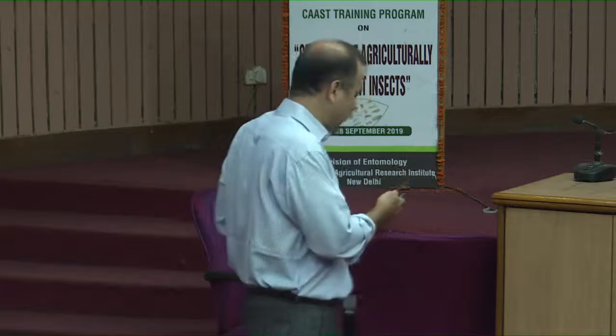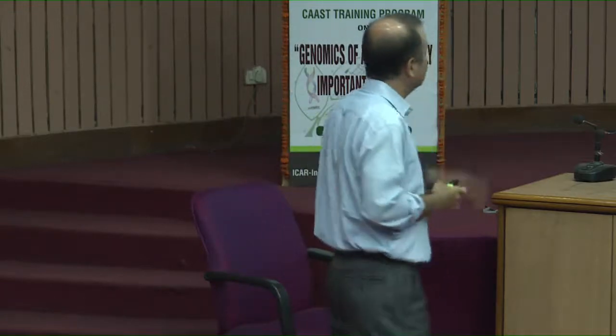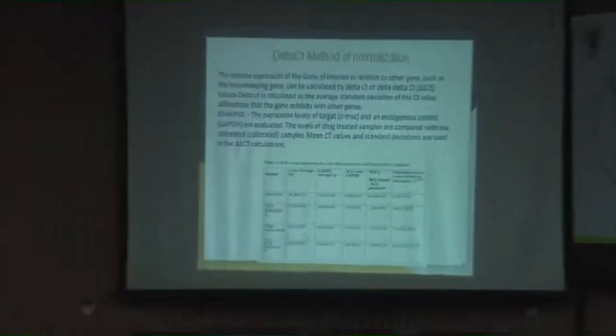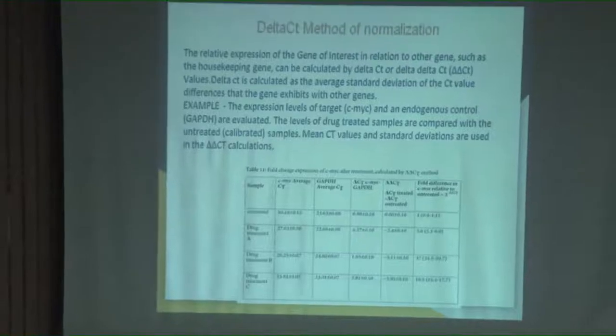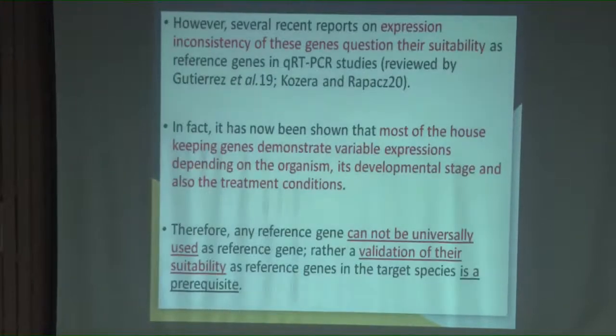And in qPCR, I have just given you one example. It is again accessed from web resources. In qPCR, how do we do it? So, we find out the CT, say here, sorry.